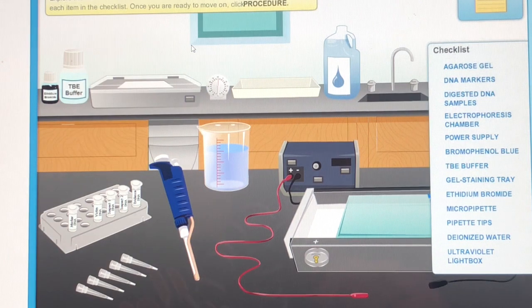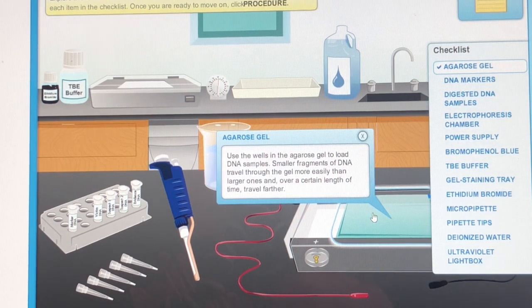Explore the lab to learn what is available for your investigation. You must click on each item in the checklist. Once you are ready to move on, click Procedure – Agarose Gel. Use the wells in the Agarose Gel to load DNA samples.